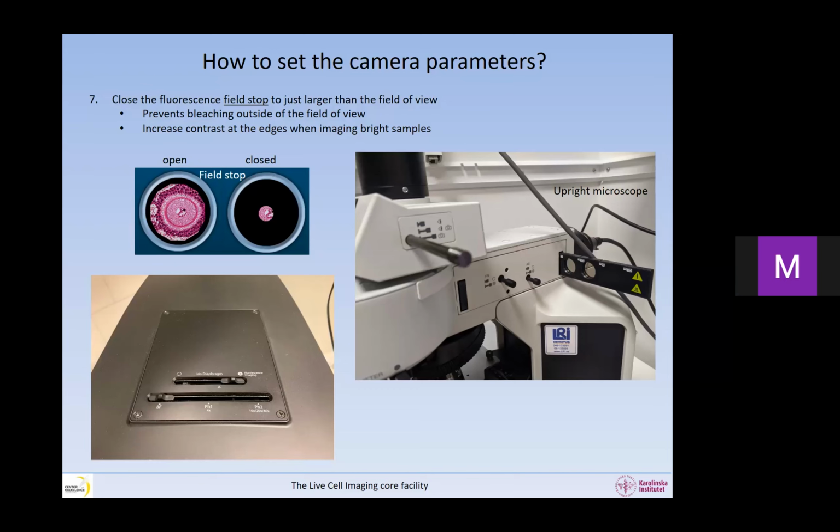I was just thinking with the photons, but I guess you have the same amount of photons. Yes, but they are diluted. When you magnify more, each pixel will receive less photons, and therefore you get a higher contribution of the noise. So it is a balance between all these things. If you fulfill the Nyquist criterion with the 60x, I would definitely go for the 60x.